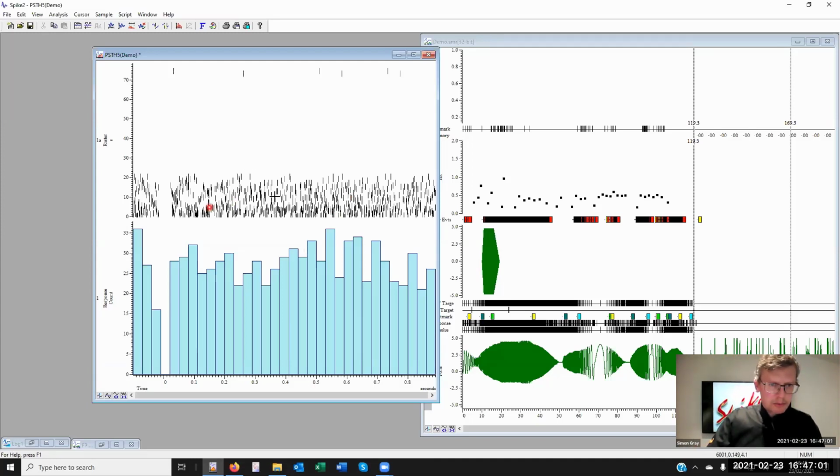Okay, we'll try that again in a short while, hoping that we can get a better result out of it.